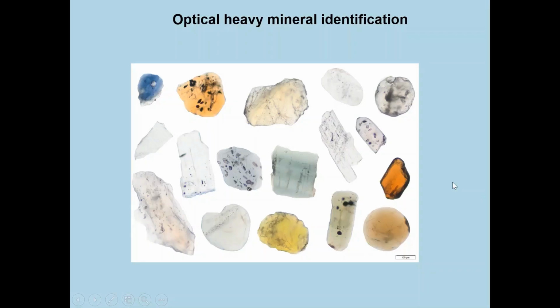Hello and welcome to the world of heavy minerals. In this video, I'm going to talk about the features you should observe if you have to identify heavy minerals by optical means, that is, by using the polarization microscope.